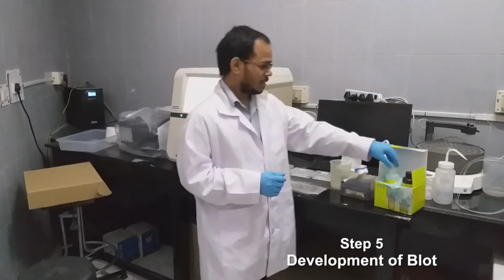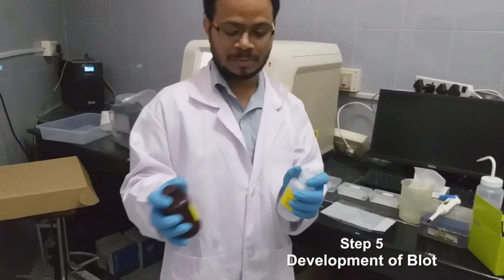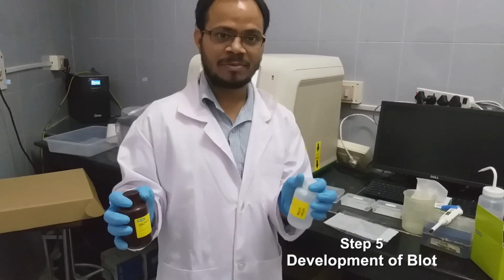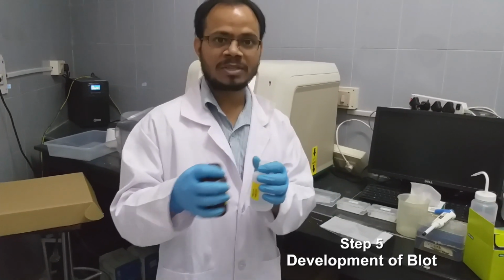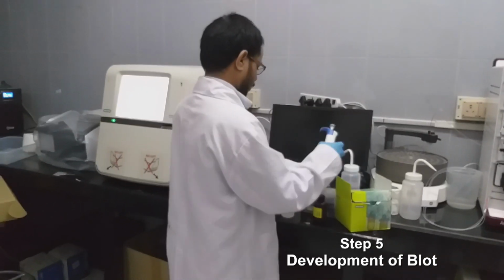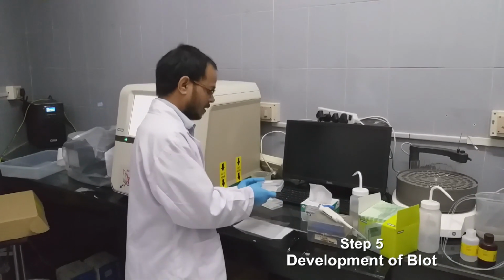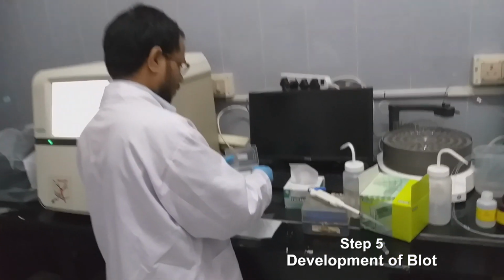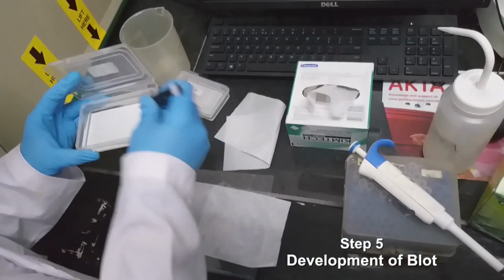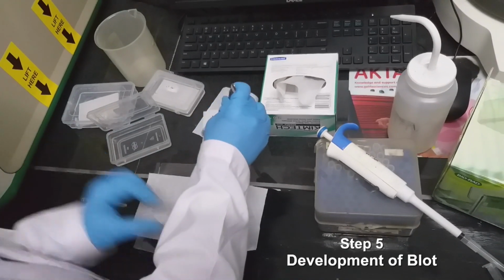These are the commercially available chemiluminescent substrate solutions. They are available from a wide range of companies. We have to mix them in a 1:1 ratio. So we take out the blot and drain whatever buffer is present properly.